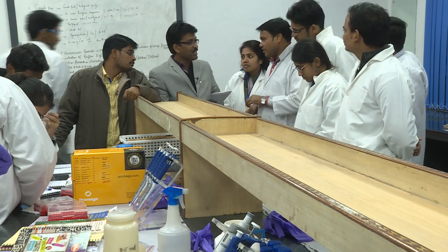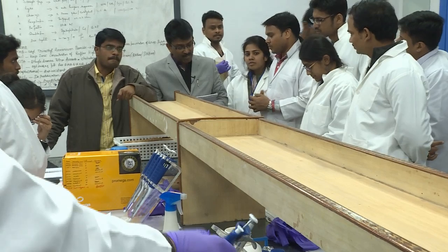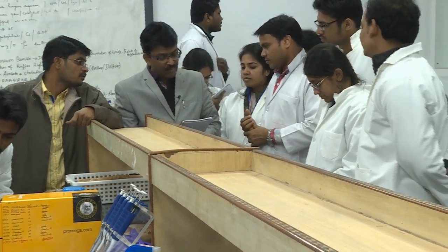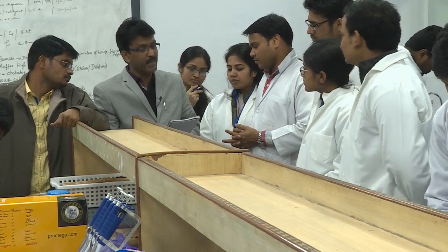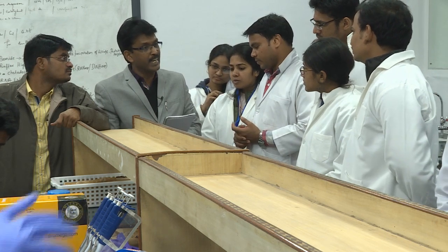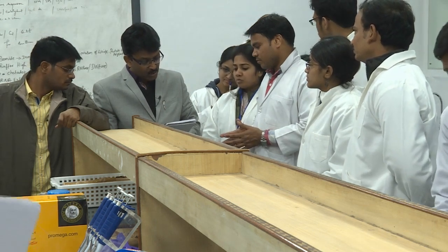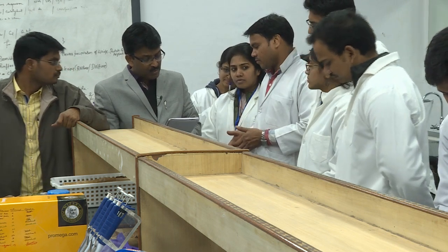This is group number 3, right? Group number 2 and 3, we have the readings now. Group number 2, Ralstonia, right? Group number 3, Ralstonia, we have 40 nanograms per microliter and 137.2 nanograms per microliter. That was done with spooling out the DNA. With centrifugation, the good reading 231 and 386. Pseudomonas group 351, 220 and 156 and 101.